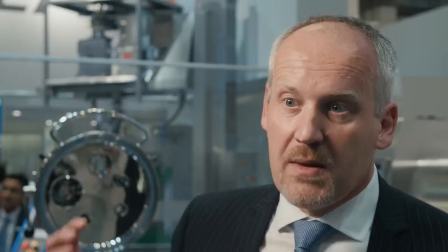That's all done by the modular basis of the AirConnect, and that mimics very much the very successful PharmaConnect system that we use for our mixing and blending processes.